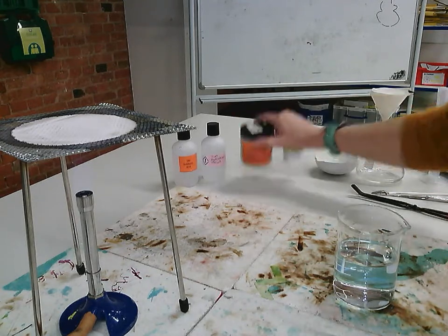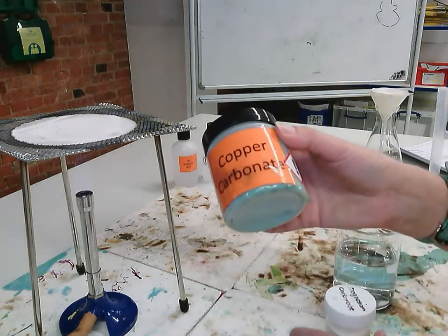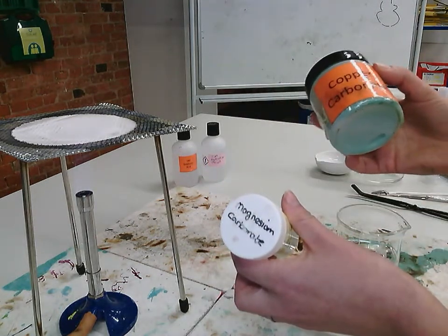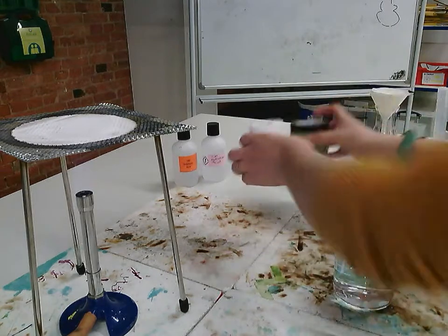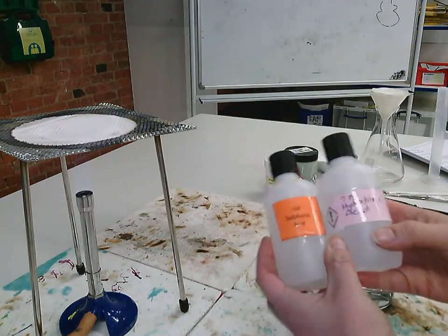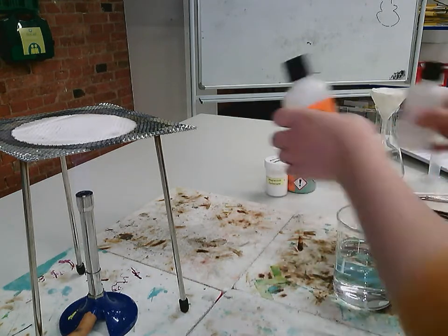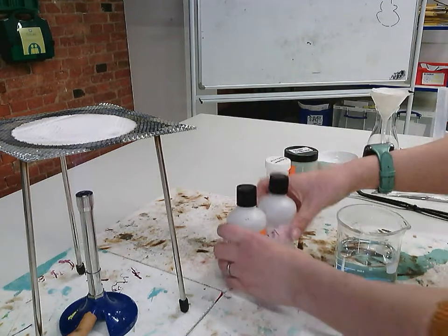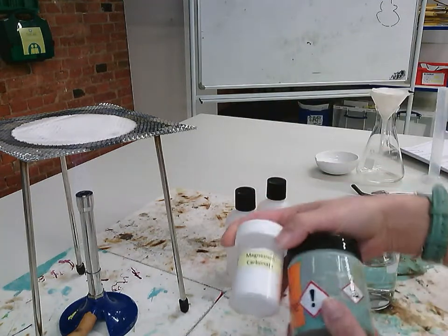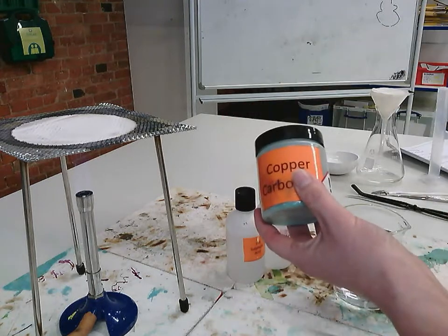So what they give you is a couple of metals. So we've got copper carbonate, and we've also got magnesium carbonate. We've also got two acids to choose from. So we've got sulfuric acid and we've got hydrochloric acid. Now, we want to make copper sulfate crystals. So first of all, out of the two metals, I'm not going to need magnesium carbonate. I'm going to use my copper carbonate.